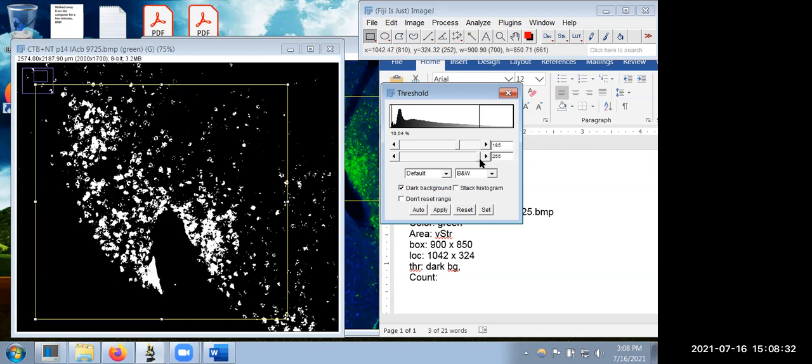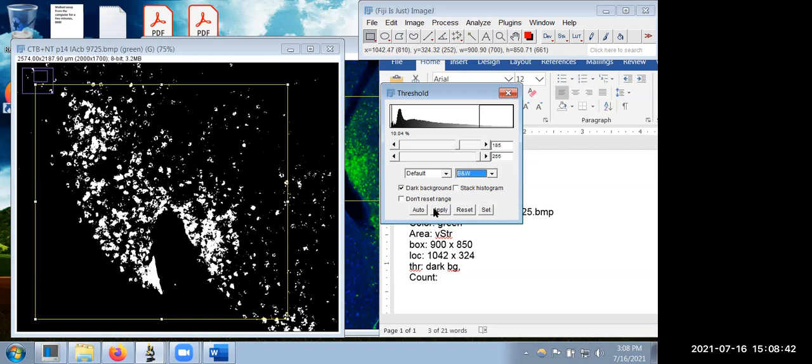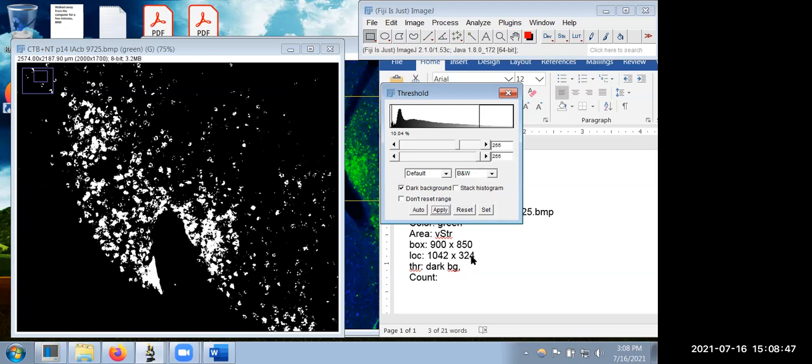We've selected black and white to keep things simple. We'll hit Apply. The threshold numbers we're going with are dark background, 185 to 255. You could substitute 'max' for 255 since it's always the same number. Now, setting up the counting process.